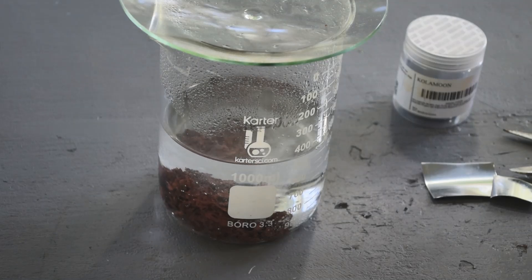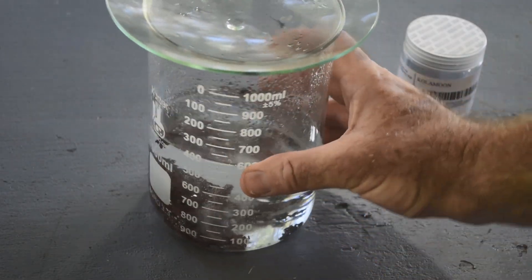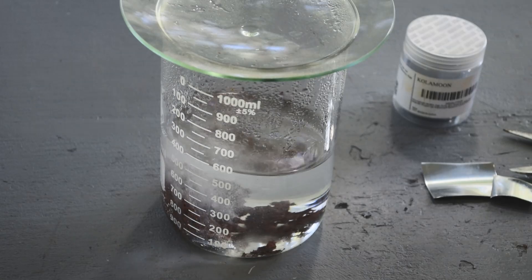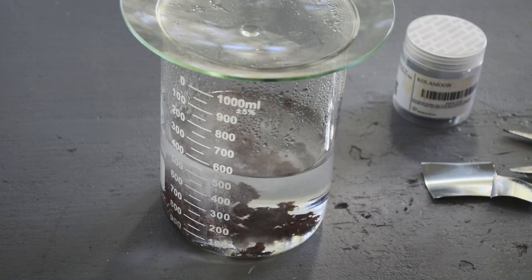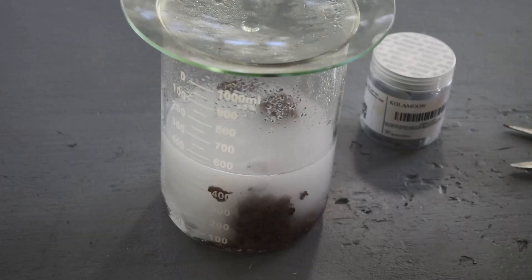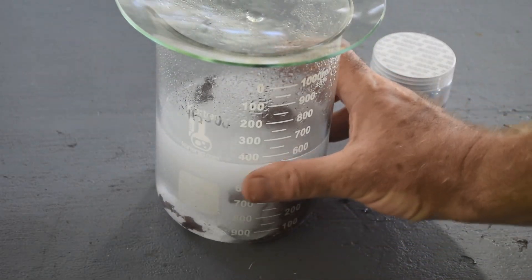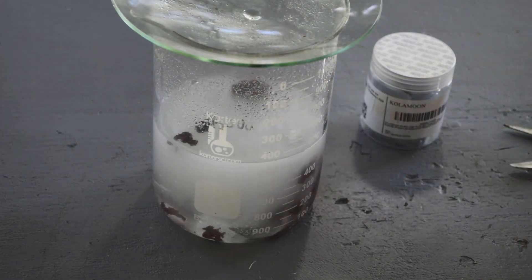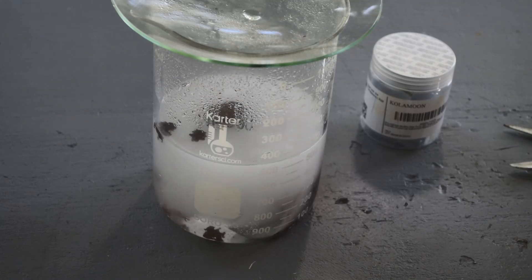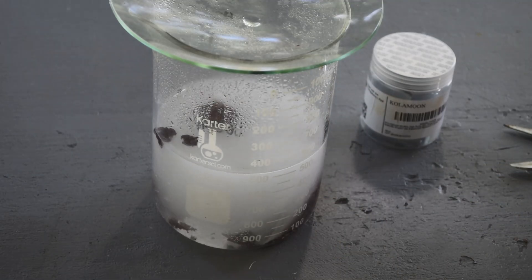That last piece of zinc is not reacting all that strongly, so I think we're about done. I'm going to let this go for a while, and if that last piece of zinc doesn't fully dissolve I'll pull it out. That looks pretty darn colorless — by the time this last piece of zinc is done reacting I think we'll have all the metal out of solution. Cool, that worked nicely.